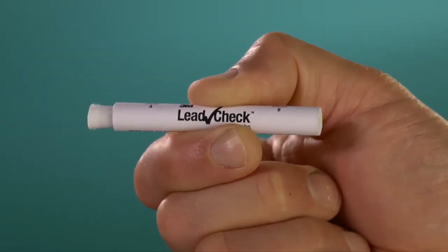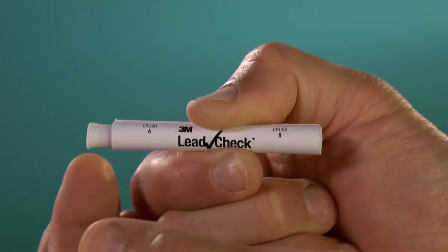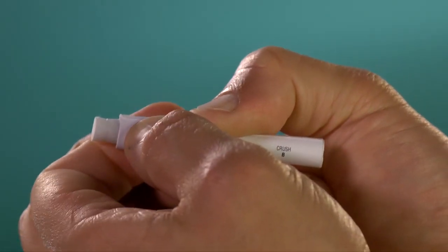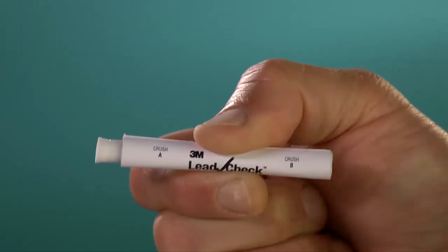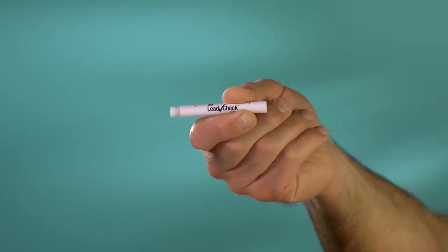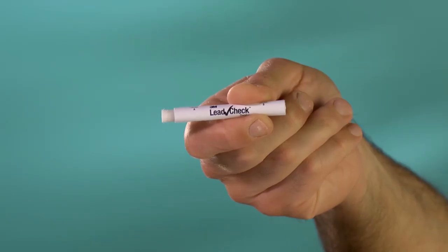Now, activate the 3M Lead Check swab by firmly squeezing each end at the points marked A and B on the cardboard cover until you can feel and hear the ampules inside being crushed. Shake the tube vigorously for a few moments to be sure that the chemicals inside have mixed. The 3M Lead Check swab is now activated and ready for use.